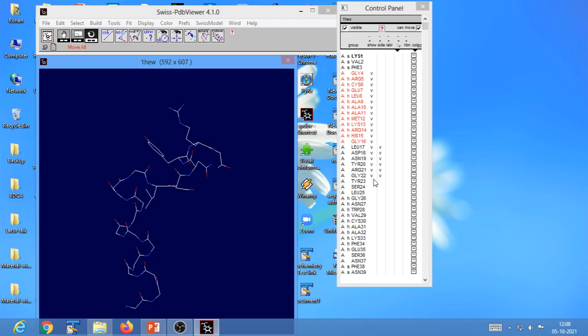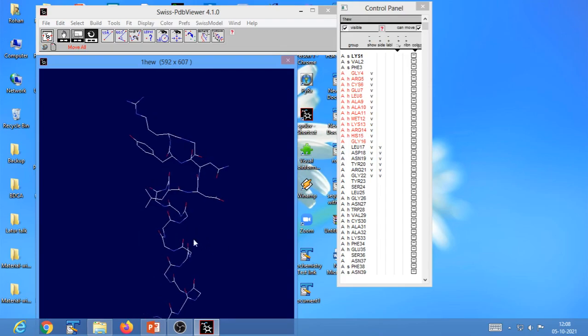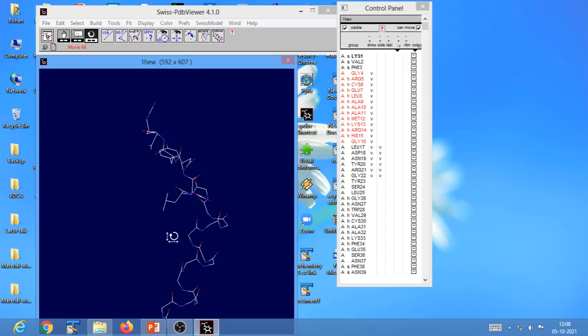Let me make this fact very clear, that it is not necessary that whatever is displayed in your visualization window is necessarily selected, or vice versa. This is the fact that I want you people to learn.